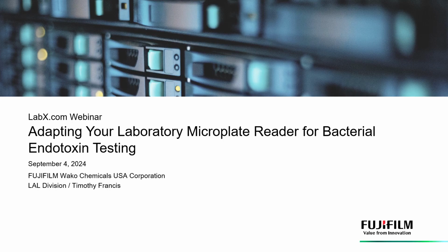I'm the Senior Technical Specialist for Fujifilm Wako Chemicals USA Corporation, and I'm excited to be providing this portion of this presentation on adapting your laboratory microplate reader for bacterial endotoxin testing with Molecular Devices. I'm going to be presenting to you an overview of the bacterial endotoxin test, as well as some of the studies we've done with the reader and its performance with our reagent.